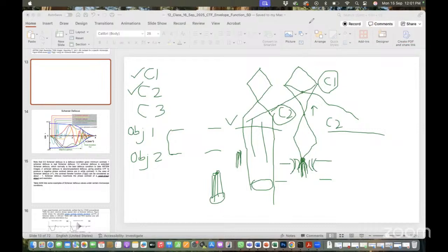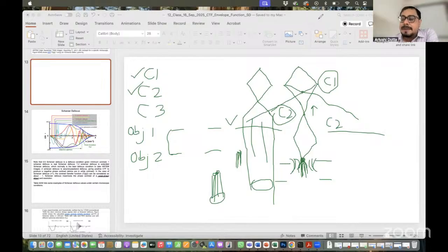And what does the C2 lens do for imaging biologicals, like low dose? The C2 lens is basically regulating your intensity and the beam diameter. If you look at this, the C2 lens is helping decide where your crossover point will be.